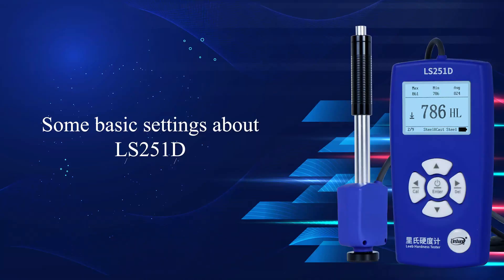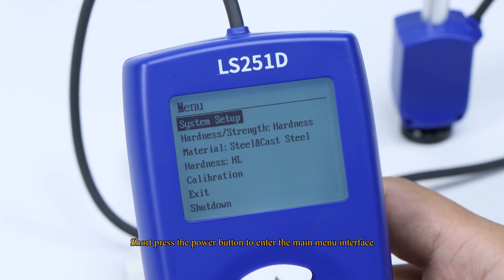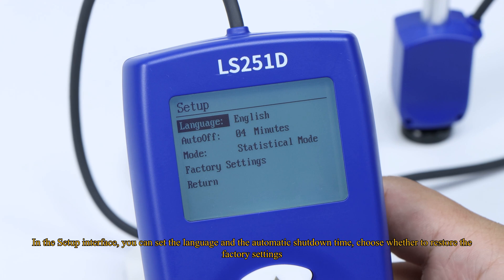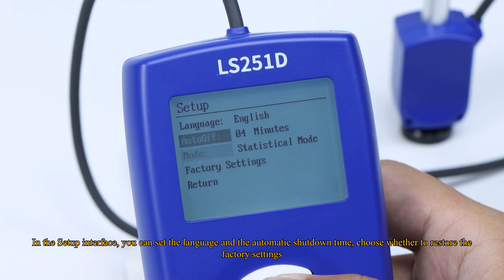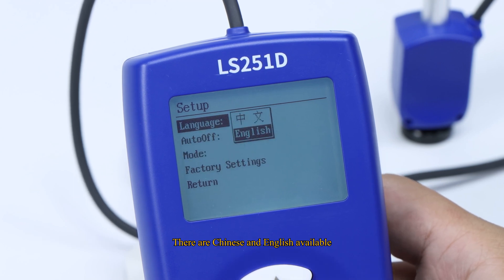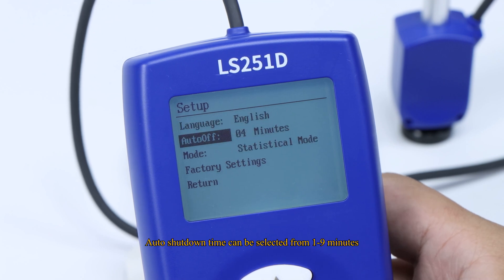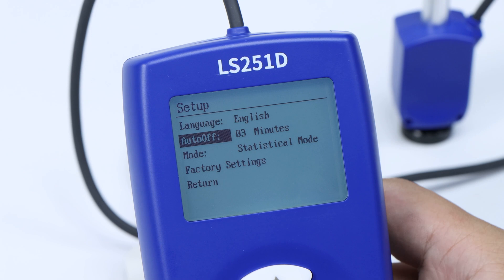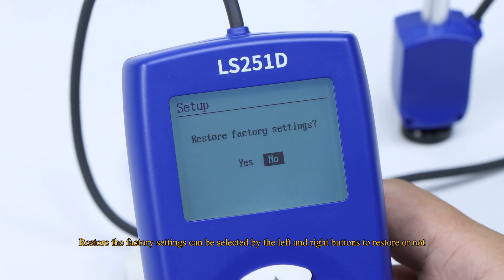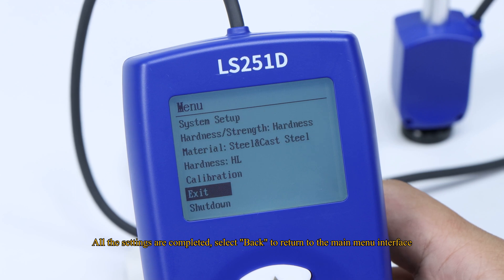Some basic settings about the LS251D. Short press the power button to enter the main menu interface. In the setup interface, you can set the language and the automatic shutdown time, and choose whether to restore factory settings. Chinese and English are available. Auto shutdown time can be selected from 1 to 9 minutes. Factory settings can be restored or not using the left and right buttons. Once all settings are completed, select Back to return to the main menu interface.